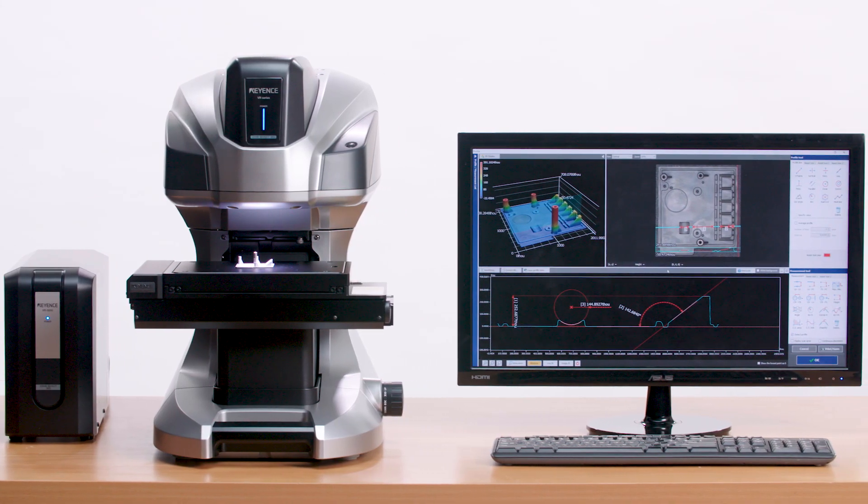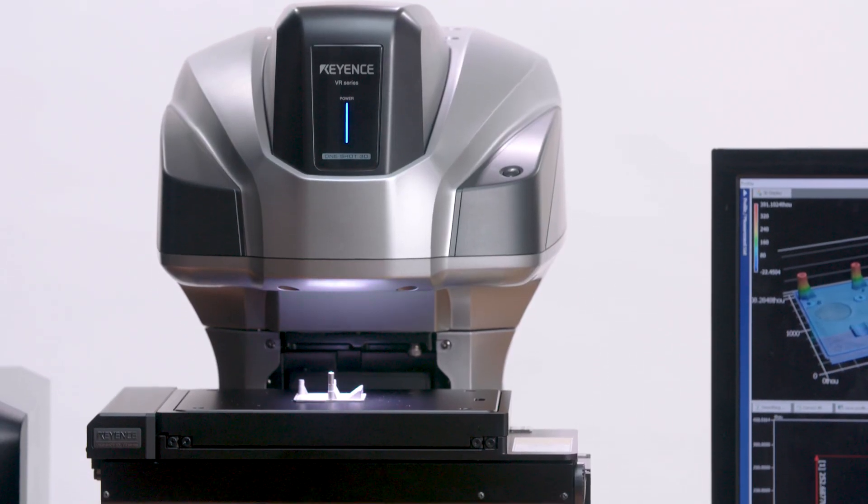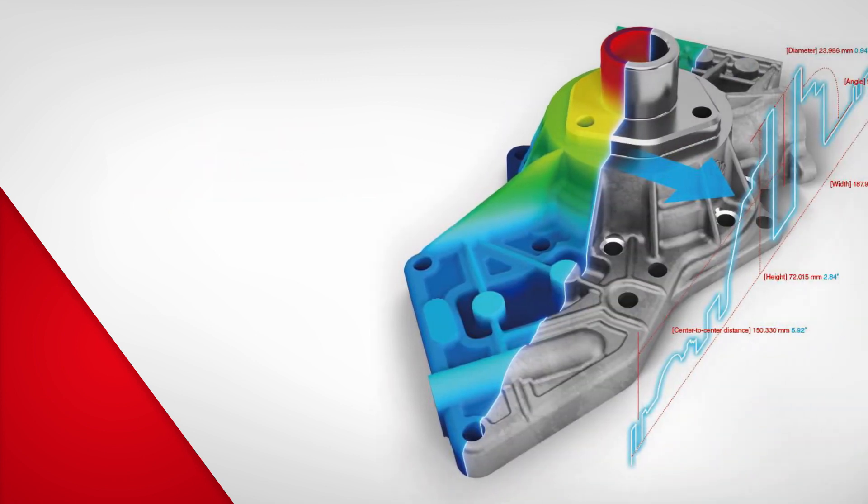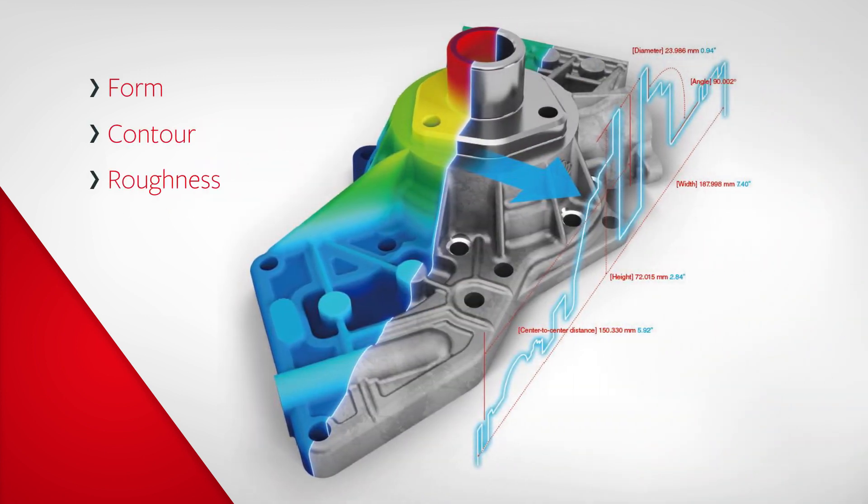Keyence is proud to announce the newest innovation to its 3D microscopy and surface measurement lineup, the VR5000 wide area 3D measurement system designed to measure form, contour, and roughness in as little as one second.